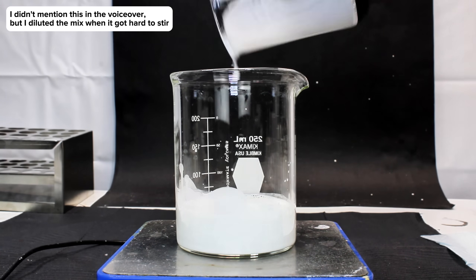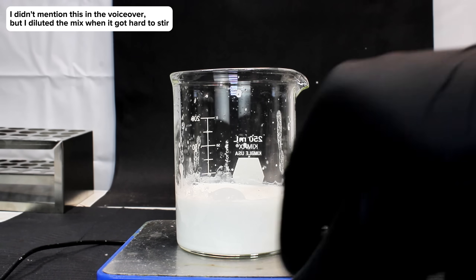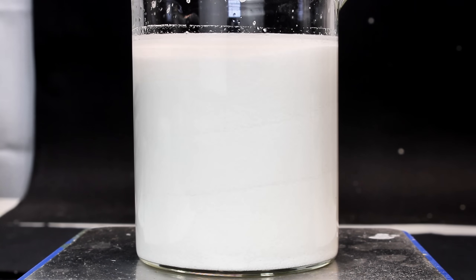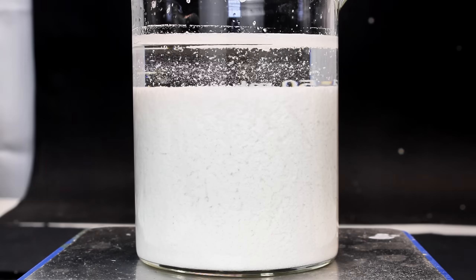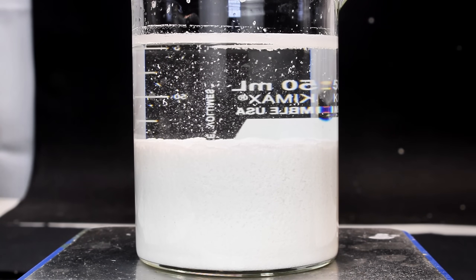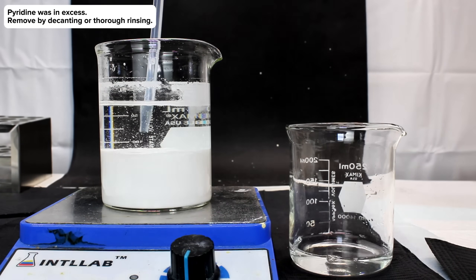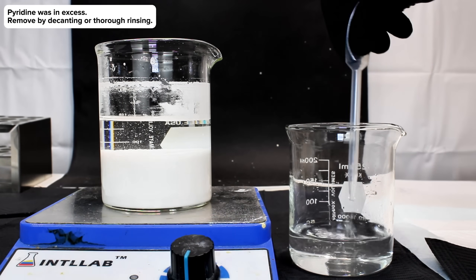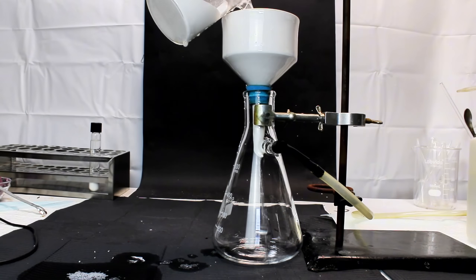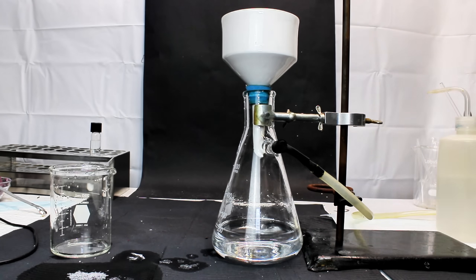I went ahead and allowed the mixture to continue reacting for a couple minutes and then turned off my stir plate. As soon as the stirring was gone, the dense complex quickly settled to the bottom, which is really convenient for decanting off the wastewater. To clean my final product of excess pyridine, I basically just decanted the clear liquid off the top, added more distilled water, waited for the complex to settle, and then repeated the process two more times. The resulting mixture was passed through vacuum filtration to collect the solid product and dried in open air overnight.